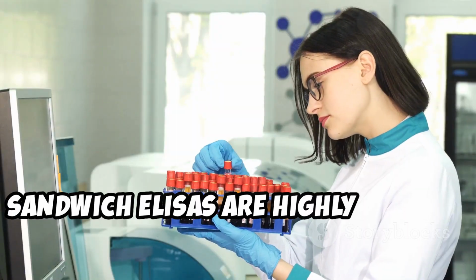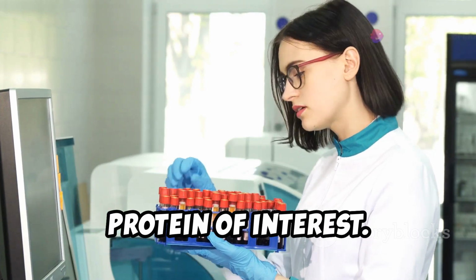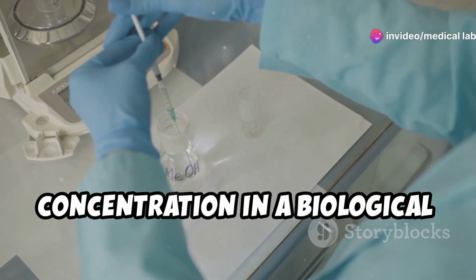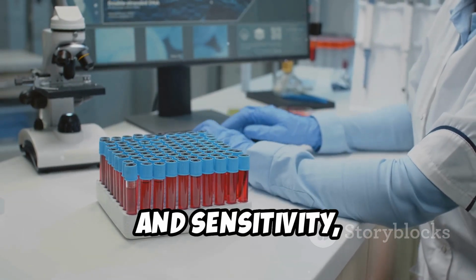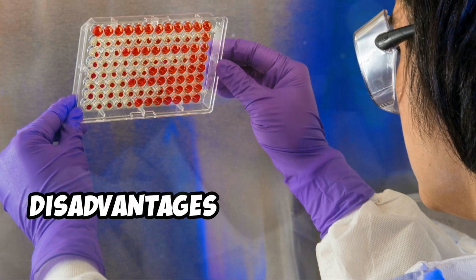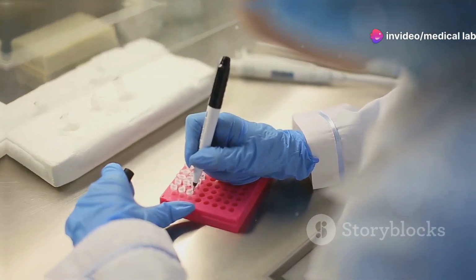Sandwich ELISAs are highly specific since two antibodies are required to bind to the protein of interest. When to use: determining analyte concentration in a biological sample. Advantages include highest specificity and sensitivity, and compatibility with complex sample matrices. However, disadvantages include a longer protocol and the challenge of development.